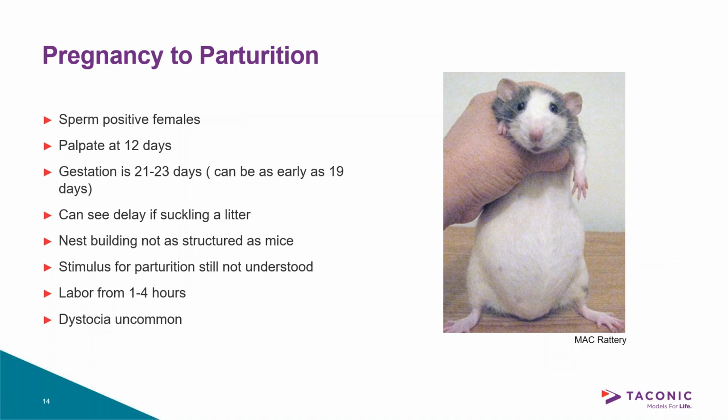So this is a pet rat, that's why there's no gloves in the picture, but I thought it was the best picture of a nice gravid or pregnant female. So you can see her nice round belly. She's probably due any day to have some pups.